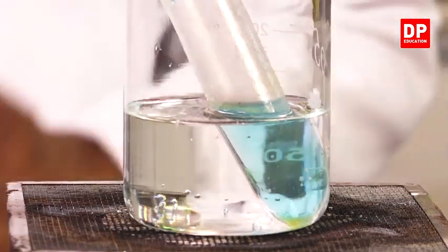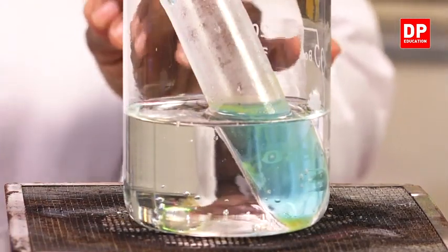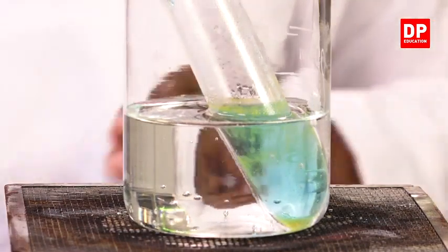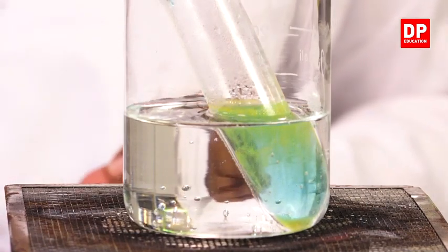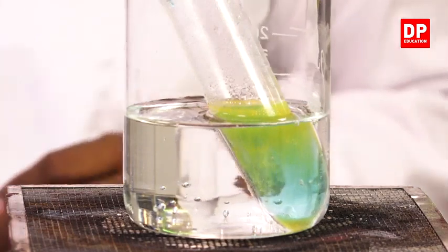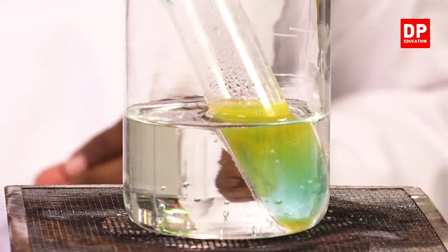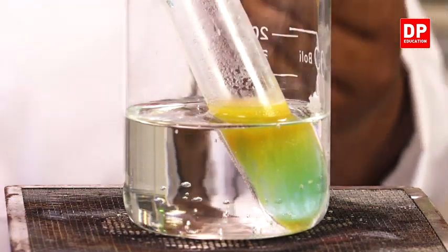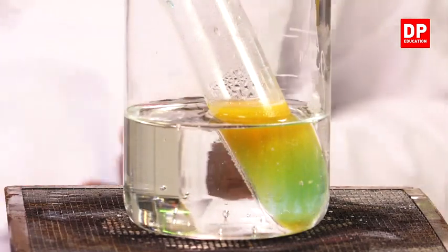You can see at the bottom of the boiling tube there is a light green color appearing. So the mixture will completely become green in color first. After green, you can see the appearance of yellow color.